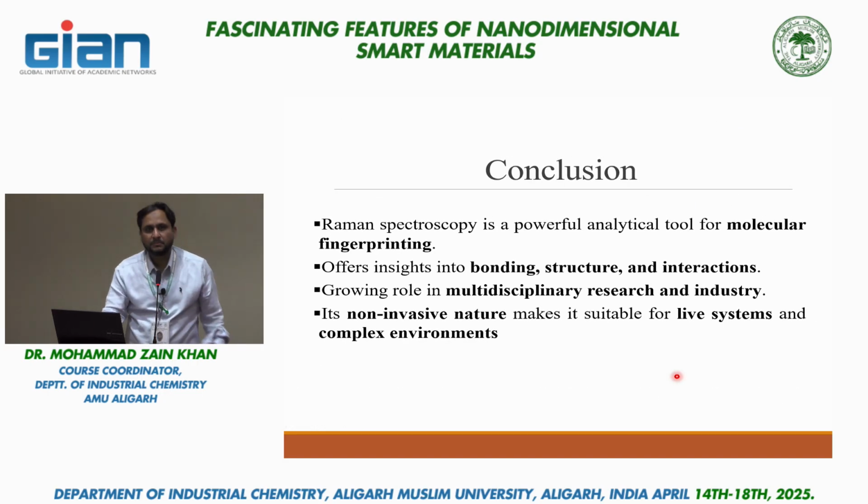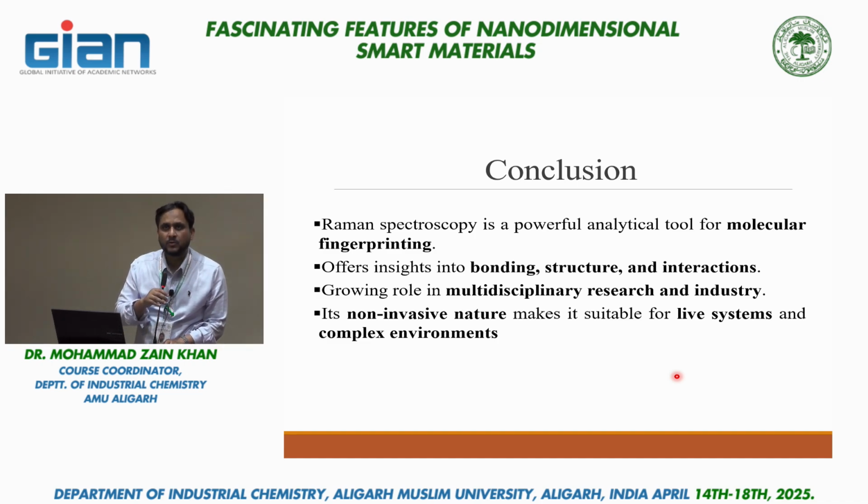Conclusion: it is a powerful technique, complementing IR spectroscopy, used for compounds which are inactive in IR, especially useful for diatomic molecules or symmetrical triatomic molecules. Its role is growing in interdisciplinary areas, in material sciences, biotechnology, DNA. Since it is a non-destructive or non-invasive technique, we can use it for living systems, in vivo studies as well.